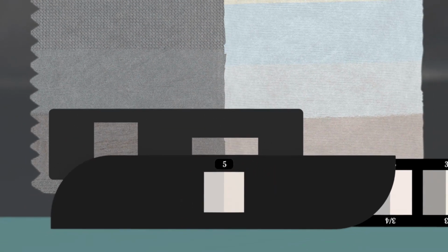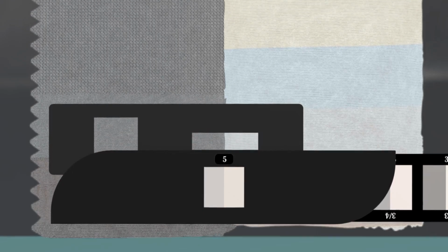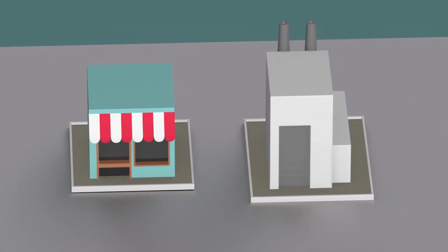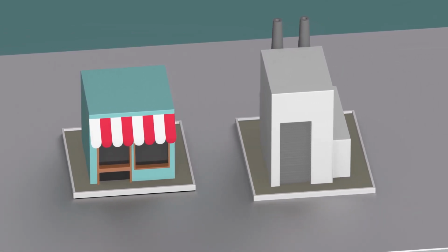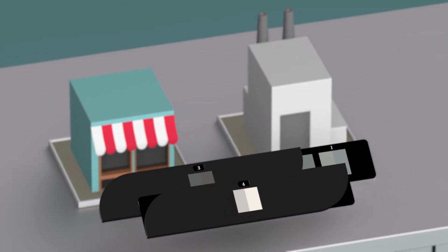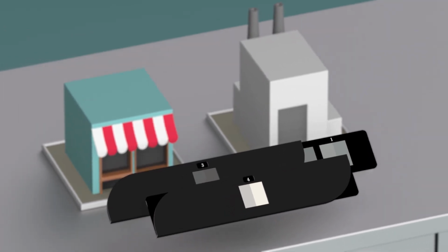Grades progress from 1 to 5 for each scale, measuring the uptake of color onto the adjacent components against the ecru of the unstained piece of multi-fiber DW. 1, the poorest result, indicates a stark contrast, while the best result of 5 indicates 2 sample areas of an identical ecru with no perceptible change in shade. Each component can be assessed separately, although you may not have to record results for all 6 components depending on the specifications of the test method being carried out.